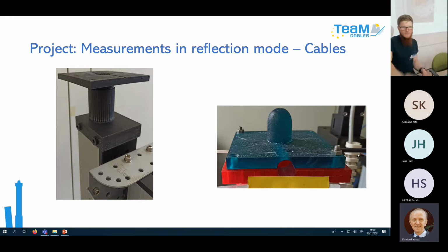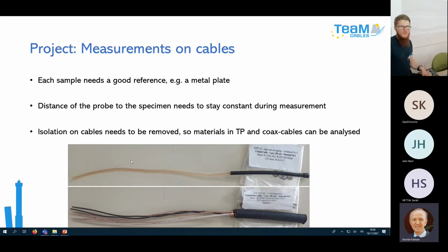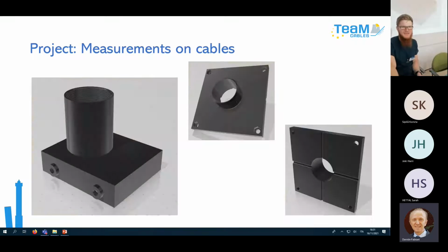And we performed 2 measurements on the cables. One right here at the end, and one in the middle of the cable, because sometimes you could make out some type of gradient starting from the end and going towards the middle of the cable, resulting from the aging, of course. We are currently still analyzing the data of the cable measurements, so we don't know yet if we can make out this gradient, but we will see. Spoiler alert.